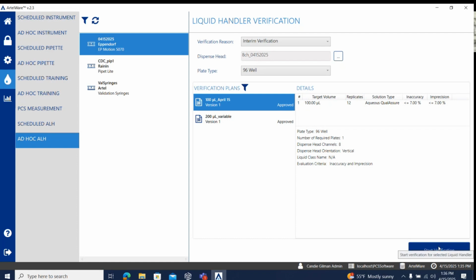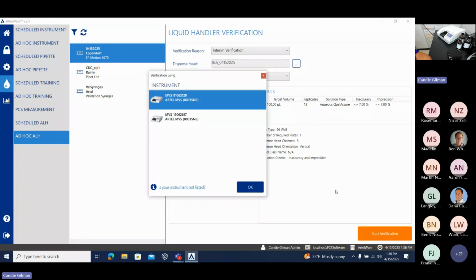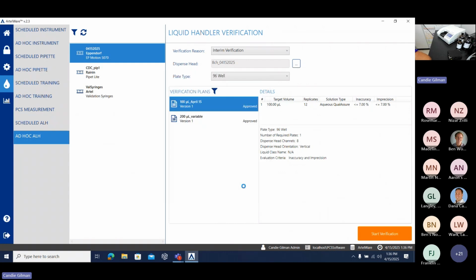But before I do that, I'm going to change my camera angle. So now what you see is the system hardware. So you can see that I've got my plate reader, I've got a shaker, and I've got all of my bottles of solutions, and I've also got a plate here. So those of you that are interested, you can click on the thumbnail video that shows the hardware if you want to see the hardware close up. And then you can alternately click back and forth on that thumbnail to either see the software or the hardware. So I'm going to go ahead and click on Start Verification. I've got a couple of different MVS systems that I've mapped to this software, but this second system is the one that I'm using today.